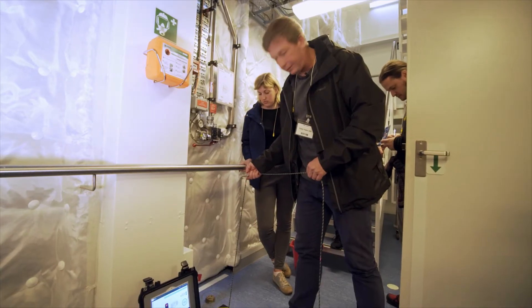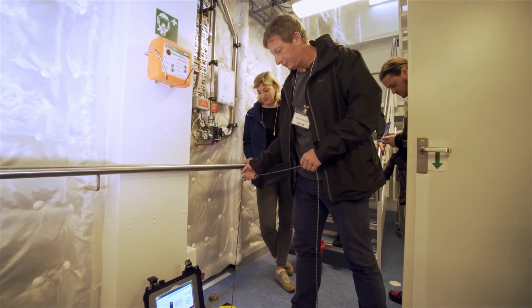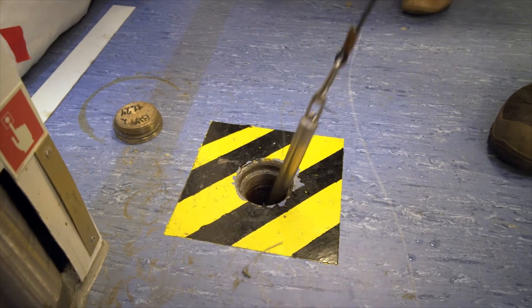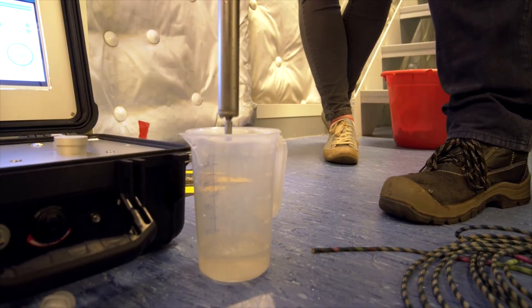So there is 11. This is how you hear it when it hits the bottom — and actually the valve opens. Then you just need to pull it out again. So we got the sample from the very bottom.